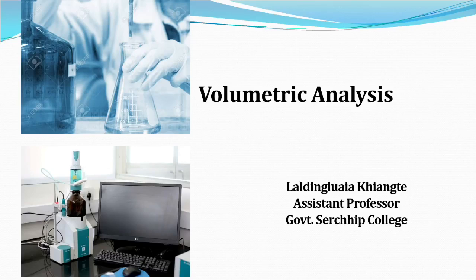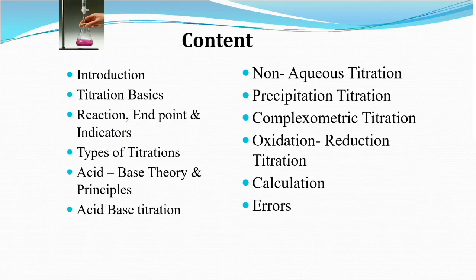Today we are going to learn about volumetric analysis. We will cover the introduction, titration basics, reaction, endpoint and indicators. Types of titration, acid-base theory and principles. Acid-base titration, non-aqueous titration, precipitation titration, complexometric titration, oxidation-reduction titration.